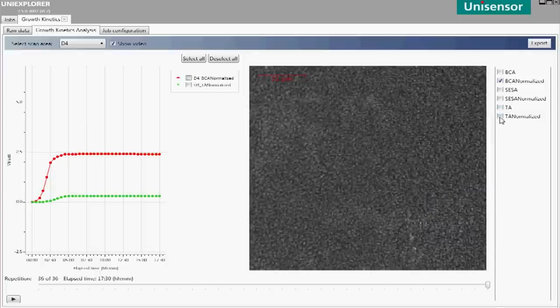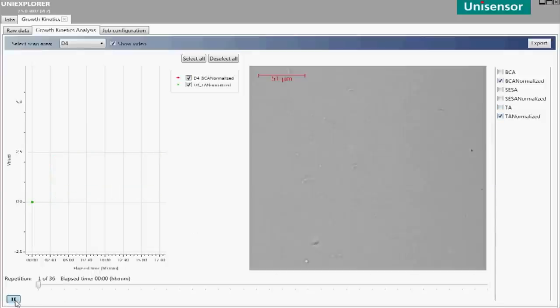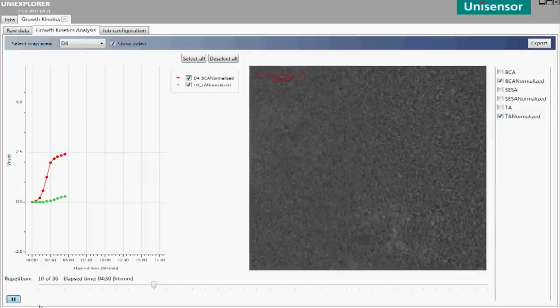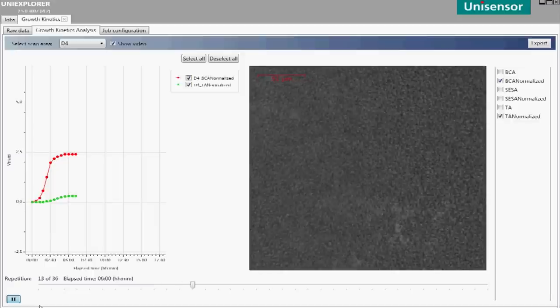On screen, you can now follow the graphs produced and see all the pictures that become part of the final film.